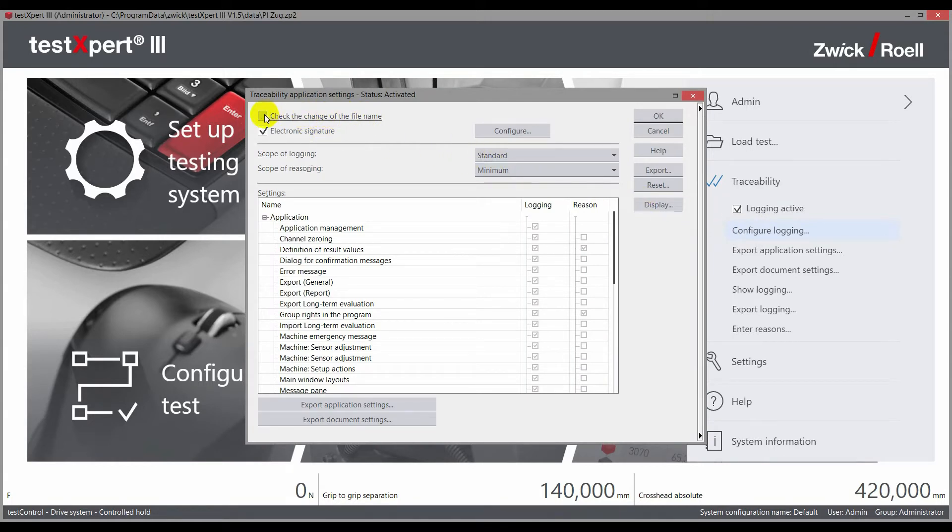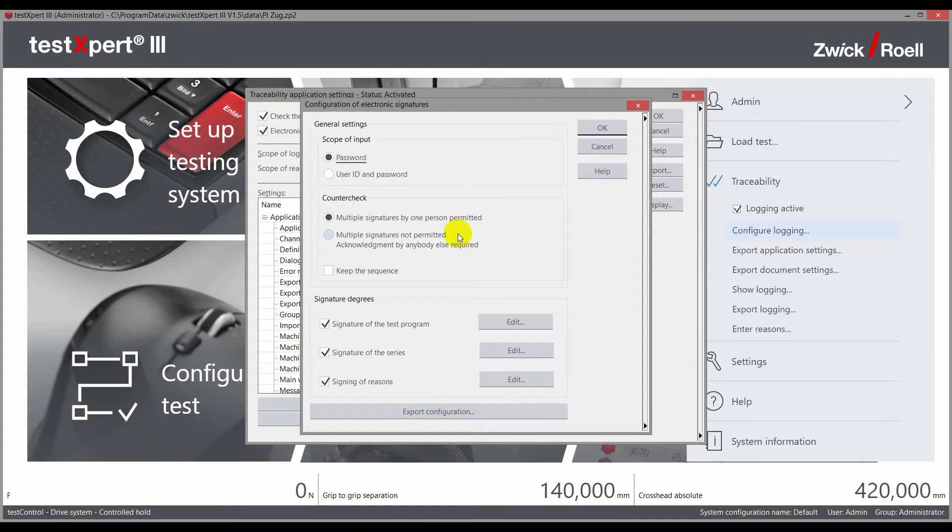In addition to basic settings for traceability, it is also possible to activate and set up an electronic signature for the data.